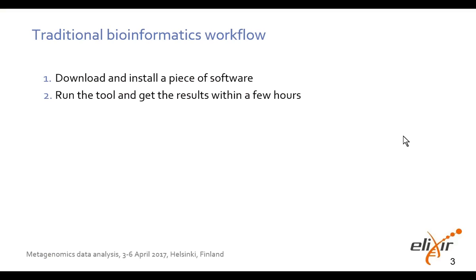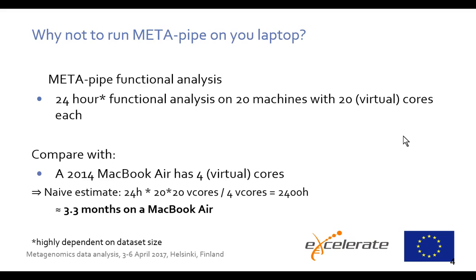So here is basically a traditional bioinformatics workflow. I mean, you download and install a piece of software and you run the tool, and then you get the results within a few hours. So why wouldn't you want to try and do this with MetaPipe on your laptop?